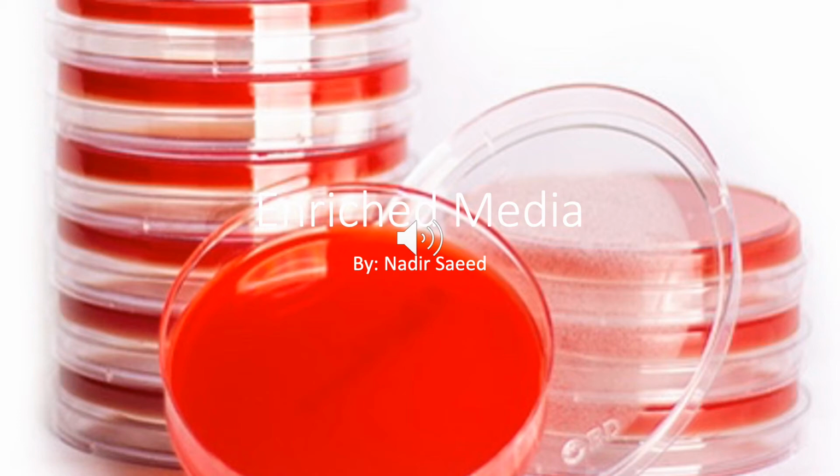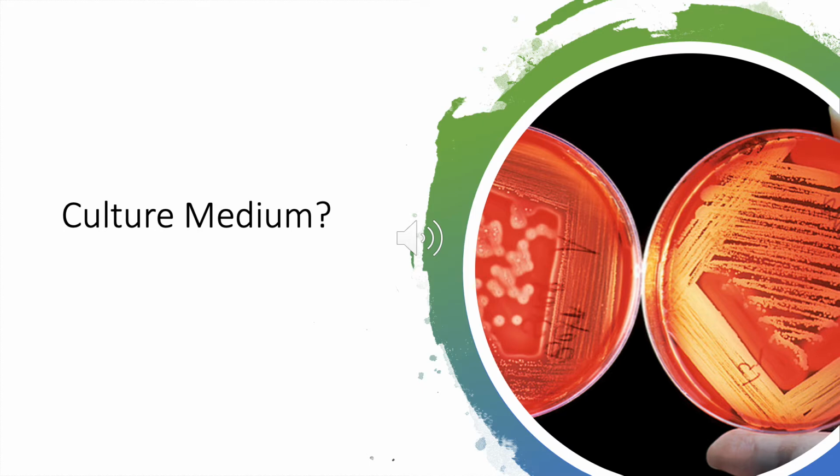Today we will be looking at enriched media. What is a culture medium? A culture medium is generally a solid, liquid, or semi-solid that is designed to support microorganism growth. There are different mediums available to grow different cell types.